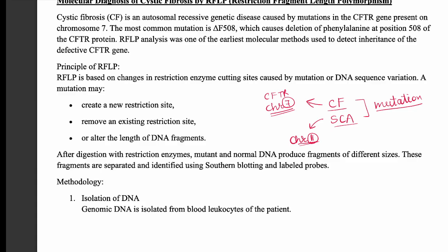So our aim is mainly to study those techniques which can help to detect these mutations, and which can help to detect whether a particular patient is normal, or is a heterozygote for that particular disease, or is a recessive one, meaning he is a homozygote for that disease.